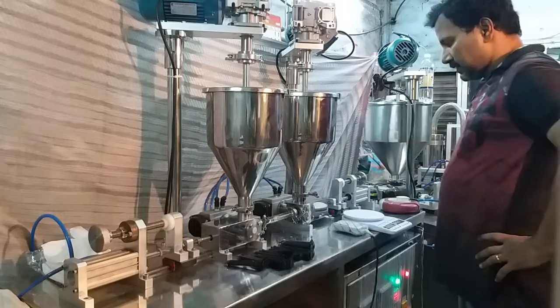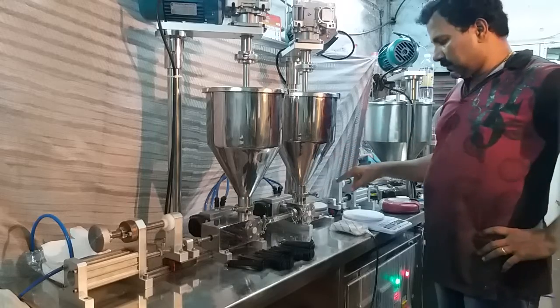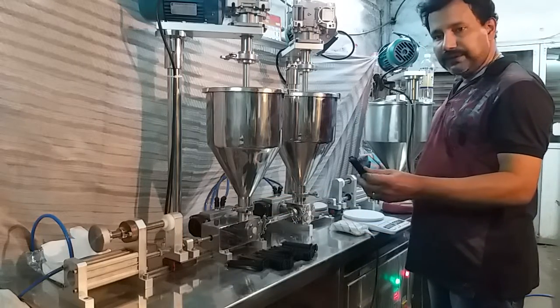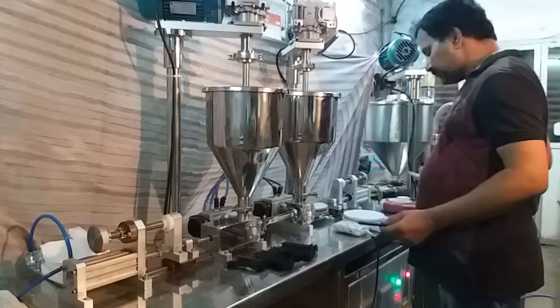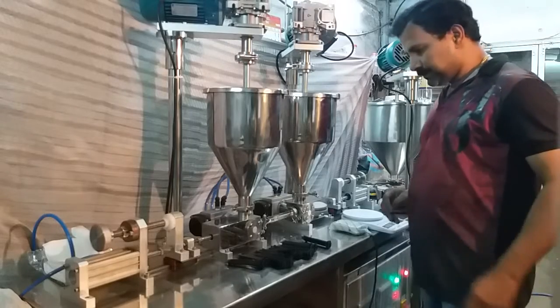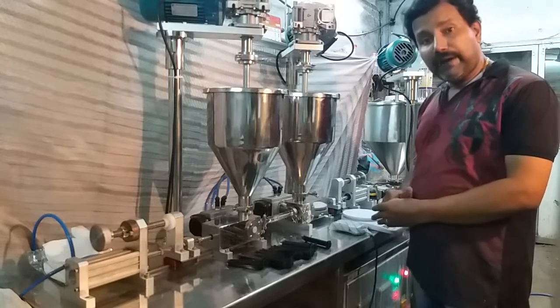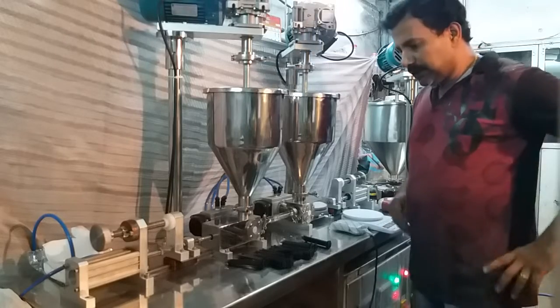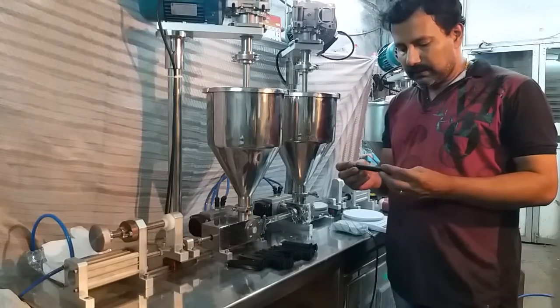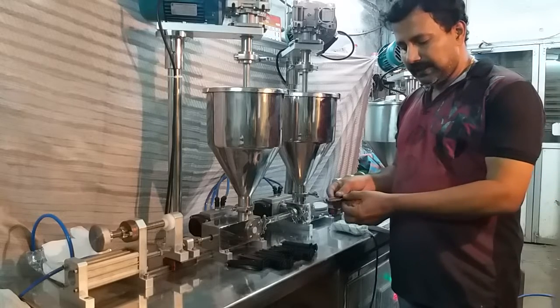The machine is a table model with two different heads fixed at opposite sides. The machine can fill dual cartridges, even single cartridges with some modification, and other types of cartridges. The fill volume starts from 0.5 cc or gram to 10 cc. This cartridge can accommodate around 3 cc of material at each side.